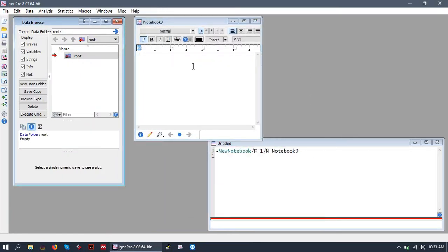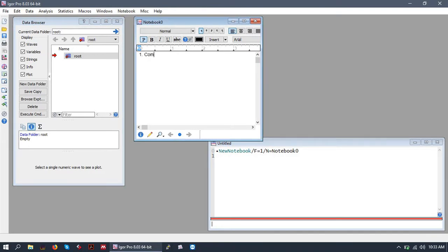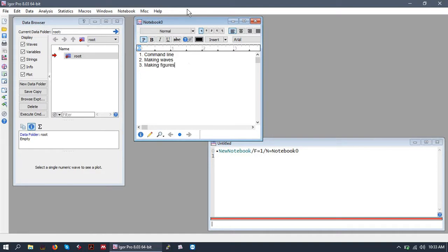And let's write down what we are going to cover. Talk a little bit about the command line. We'll talk a little bit about making waves. And we'll talk a little bit about making figures.